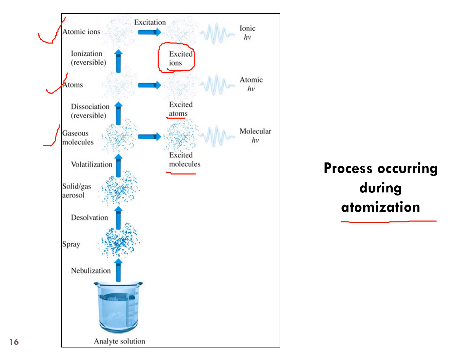Okay, so sebab itulah kalau source of the lamp tu kena line source, dia dah betul-betul emit the characteristic radiation yang metal of interest. So sebab itulah hanya atom yang akan absorb this radiation. So gas molecule tak akan absorb lah. Atomic ion tak akan absorb kecuali wavelength mereka dekat-dekat. Okay, so this will contribute to the interference lah.